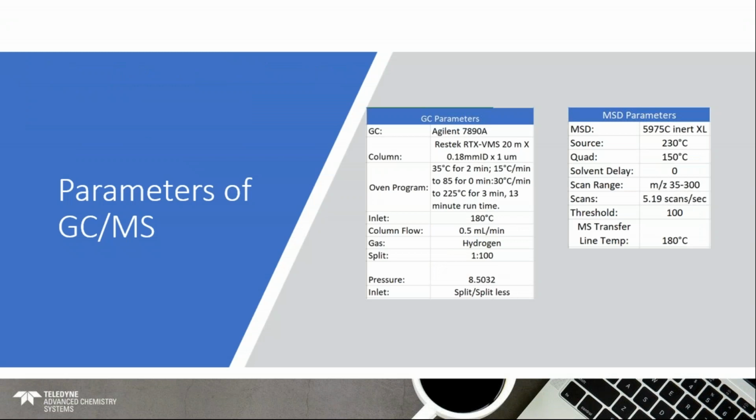For anyone interested, here's the list of the GC and MSD parameters that were used in this demonstration. A copy of the webinar is also available for your review if you would like to check the parameters of the section in greater detail.